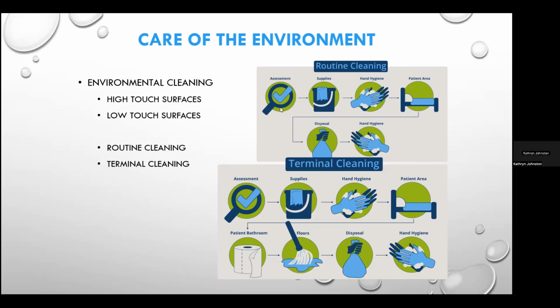When you talk about using mops, and this mop is very reminiscent of the cotton cloth mops that are used, cotton cloth mops should not be used in a healthcare setting. And the reason for that is the mop head should be removable so that it can be washed in hot water and hot air dried to decrease the bioload.